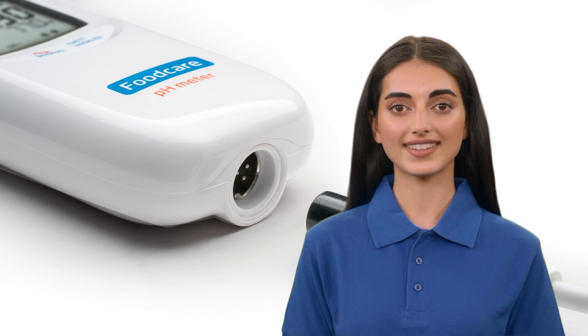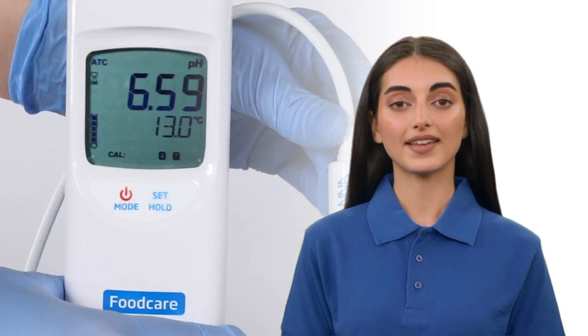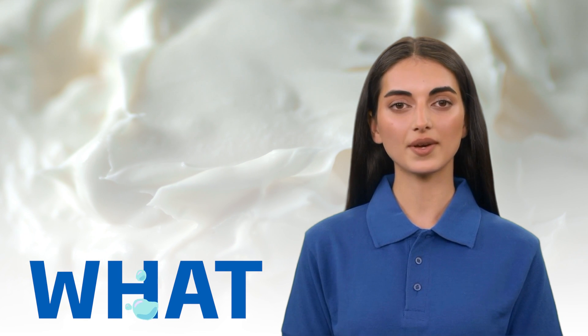The HI99161 is an ideal meter for food and dairy professionals taking direct measurements on the go. A perfect way to measure pH and temperature in various foods and dairy products, this meter is great for the direct measurement of semi-solid foods.